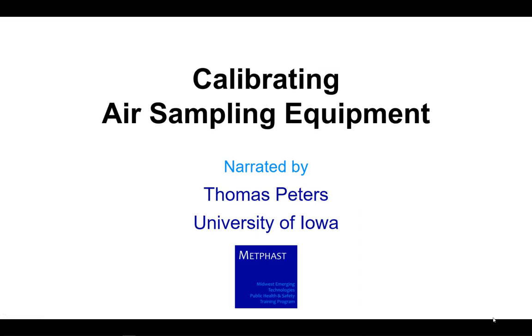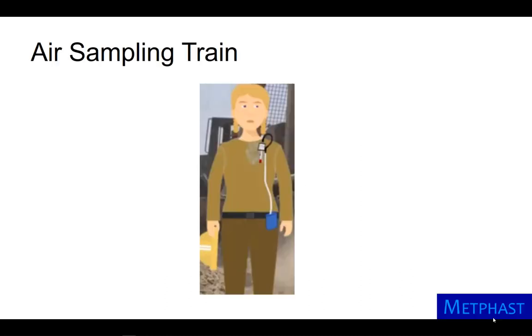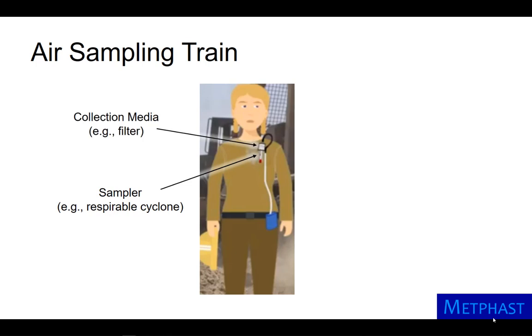Calibrating air sampling equipment. An air sampling train is used to collect a sample of hazardous gas or aerosol to assess exposures. A sample of air is pulled in from the breathing zone through a sampler, here a respirable sampler. The air then passes through collection media, here a filter for respirable sampling, and tubing.